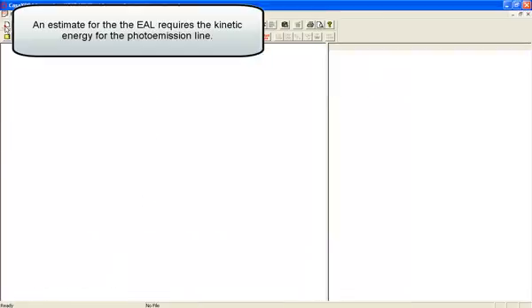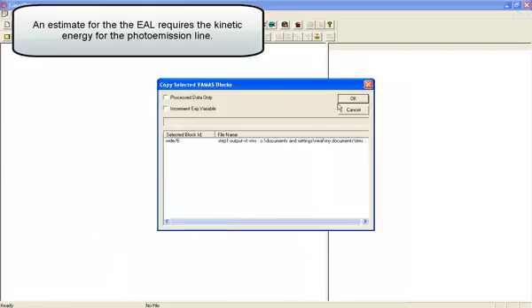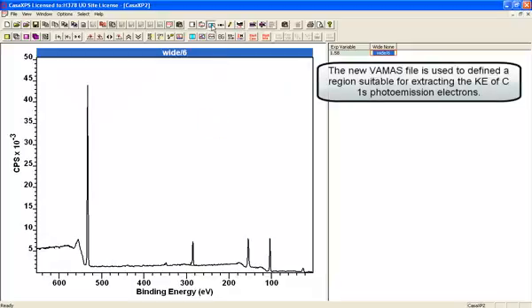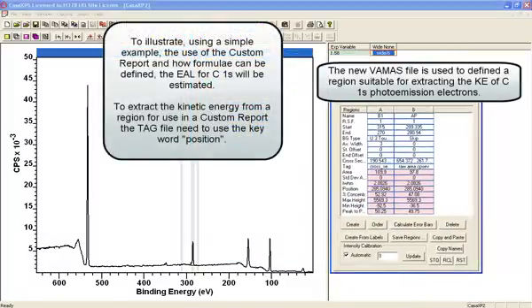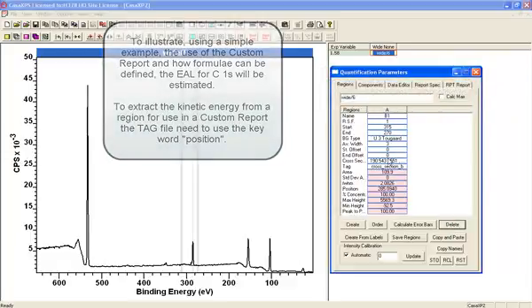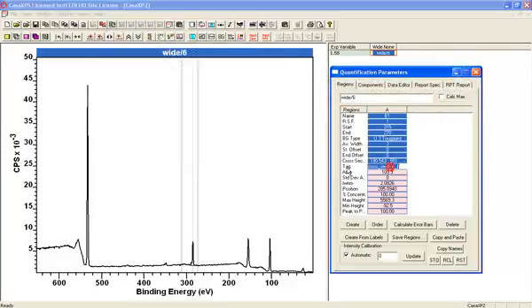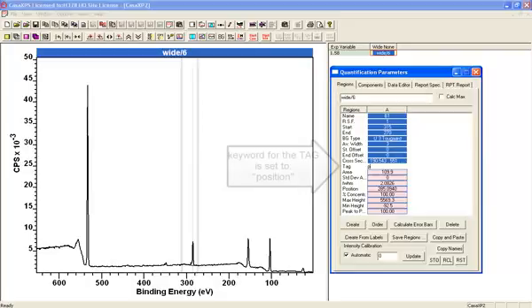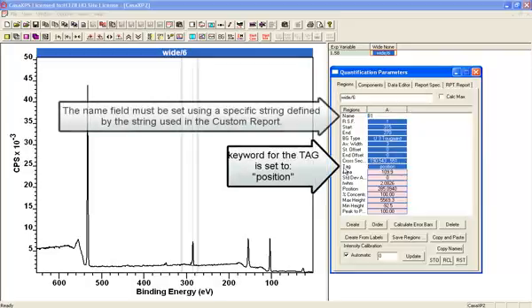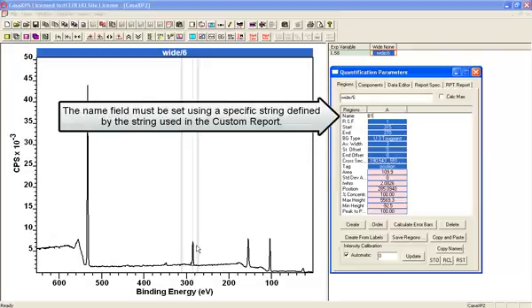what I'm going to do is copy that VAMAS block into a new file so that I can make a small adjustment to the definition. We only need the one region and I'm not interested in the cross section now. What I'm interested in is the kinetic energy for the peak we're going to use to work out the film thickness, namely the Carbon 1s.